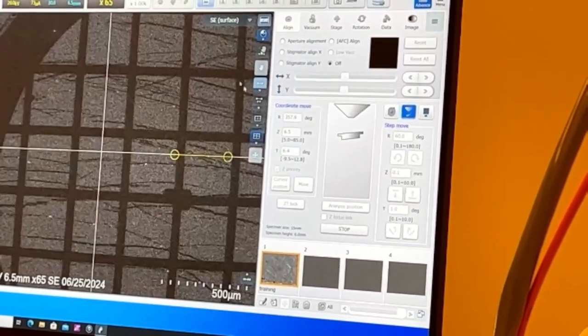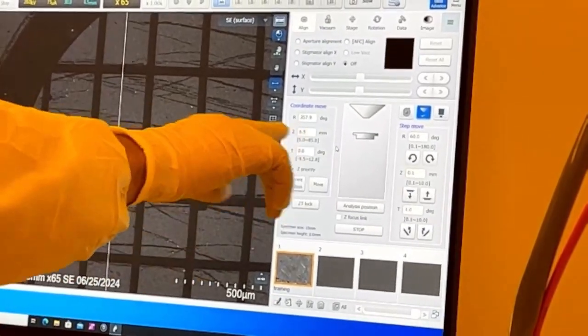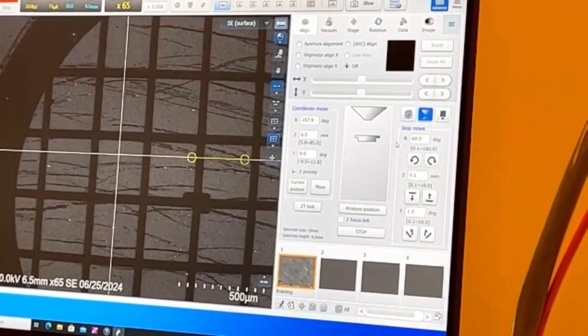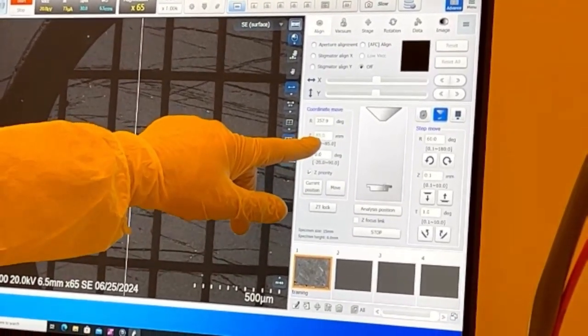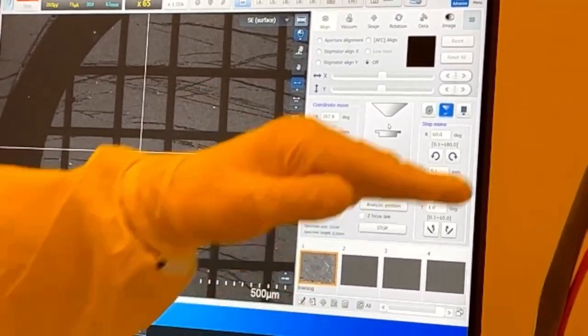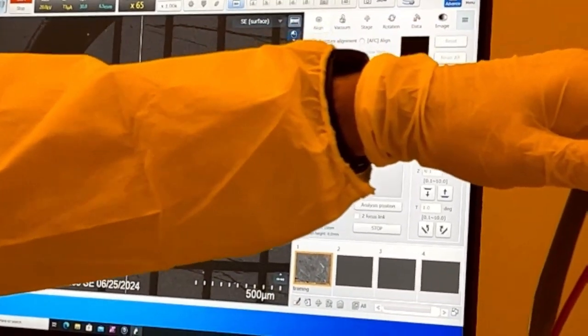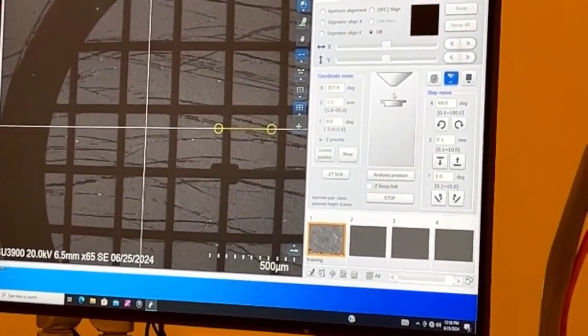All right. So you took it back to 10? So right now we're at 6.5. So we're almost as close as we can get. Look, I can only get to 5. Oh, okay. 5 won't allow us to go beyond that. Exactly. And that's what we set when we loaded it. That was the 5. So it's a safety setup. Yeah. Safety, yes.